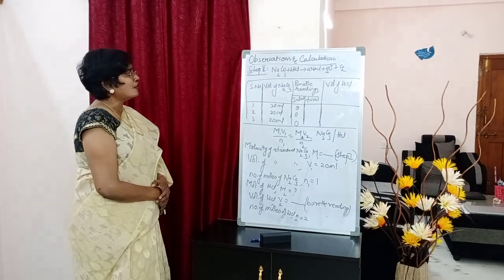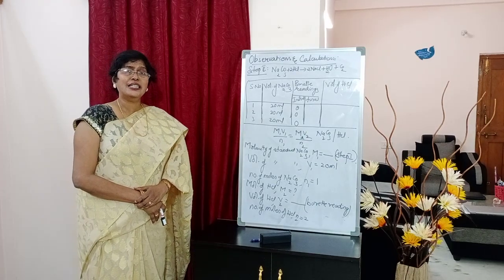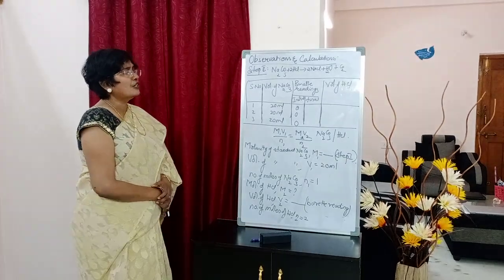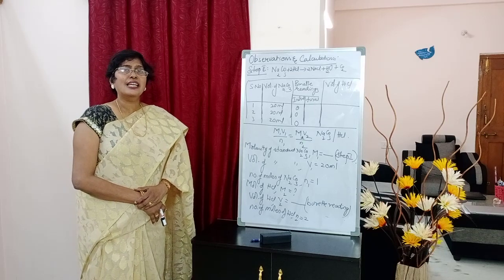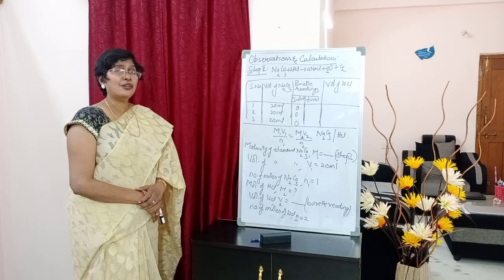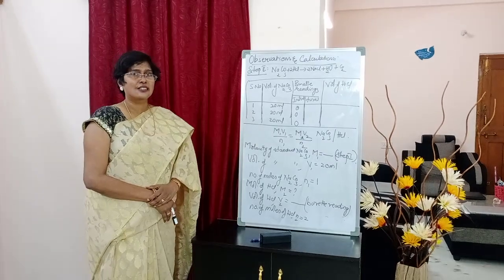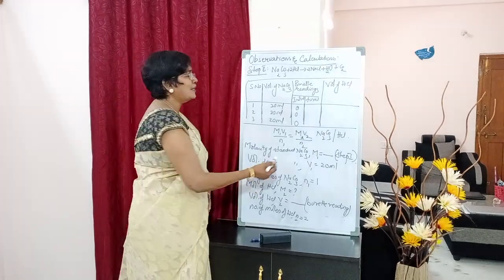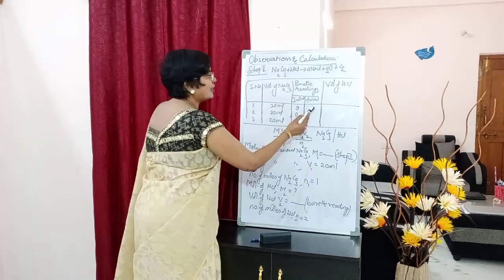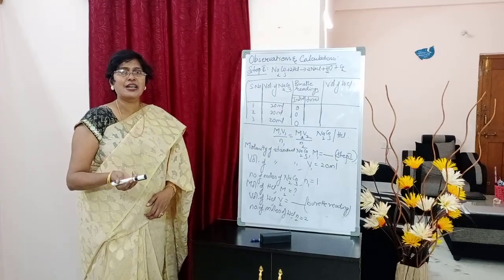Okay. So serial numbers 1, 2, 3. Write down, students. Volume of Na2CO3. We know that we have taken 20 ml. So 20 for all the three titrations. 20, 20, 20. Burette readings. Initial. You can note down it as a 0. If we fill the burette completely for all the three titrations, you can take initial reading as 0. So whatever reading you are getting at the end point, you will note down here. Suppose if it is 20.5, the same final minus initial will be volume of HCl 20.5. If it is 21, 21.